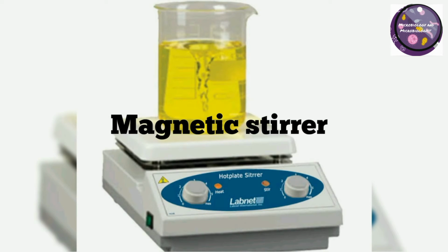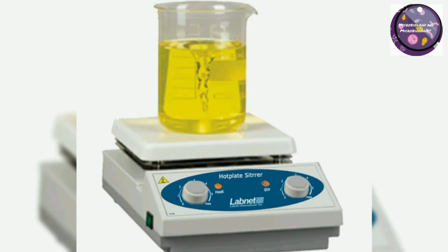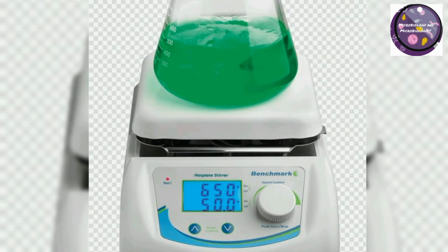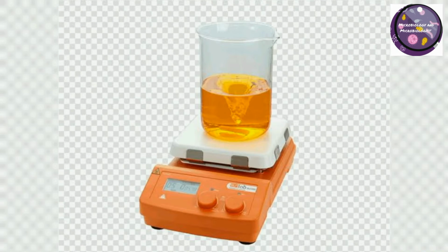Magnetic stirrer. A magnetic stirrer is a laboratory device consisting of either a rotating magnet or stationary electromagnets creating a rotating magnetic field. A magnetic stirrer often includes a provision for heating the liquid. Stirrers are often used in laboratories, especially in the field of biology and microbiology. Some are hot plate stirrer and some are magnetic stirrer. If the solution has sediments and we want to dissolve those in liquid, we may use a stirrer.